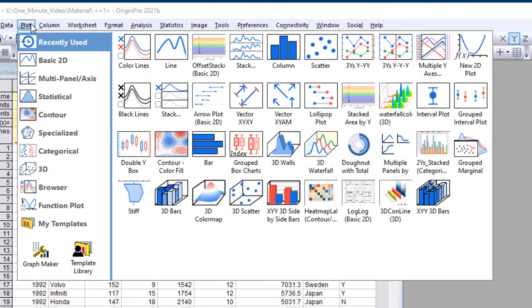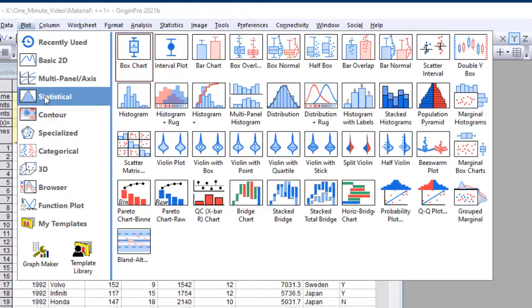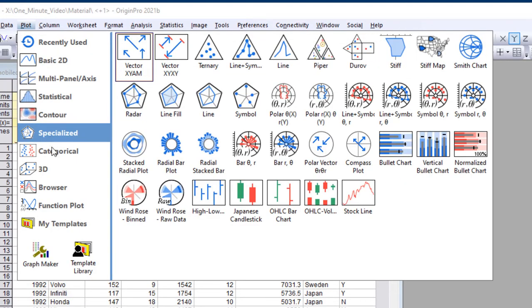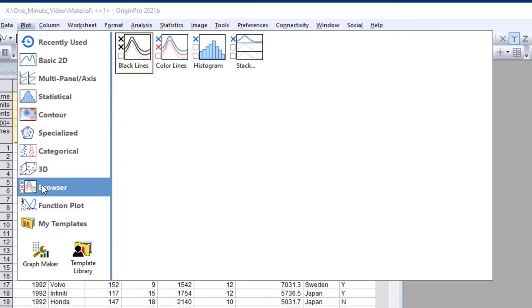Origin ships with over 200 graph templates for you to select from, arranged by category under the plot menu.